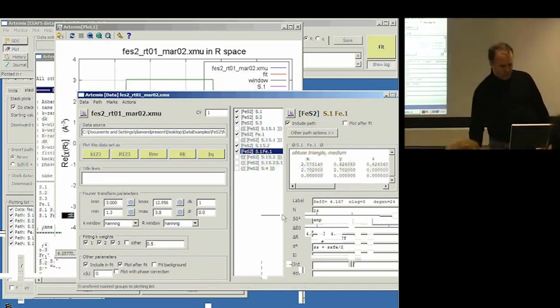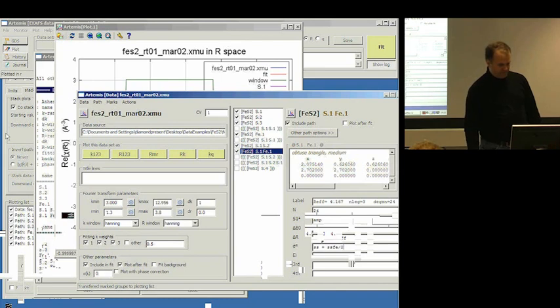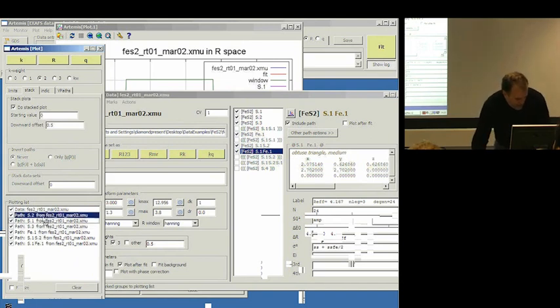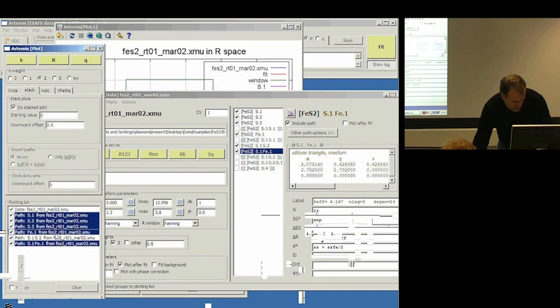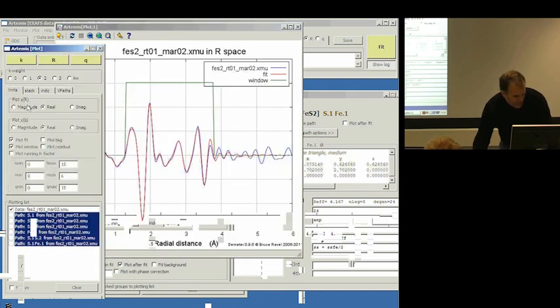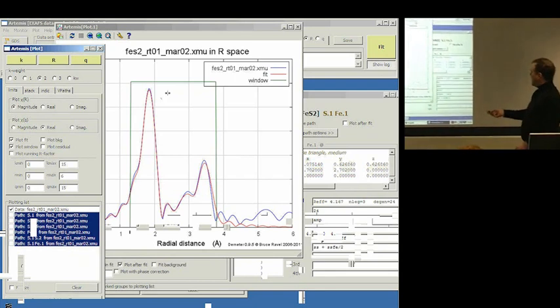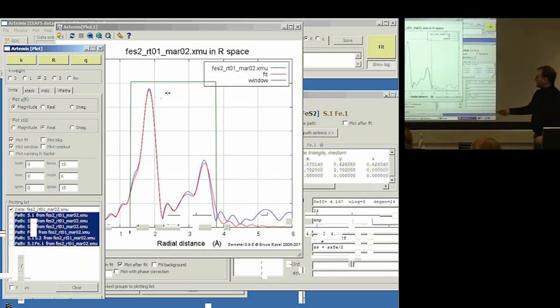I'm going to do two more things on this before wrapping it up. We still have plot, and I wanted to plot the magnitude there. We still have quite a bit of misfit out in this part of the fit, and I'd like to address that. I'd like to see if we can solve that problem before calling it quits.